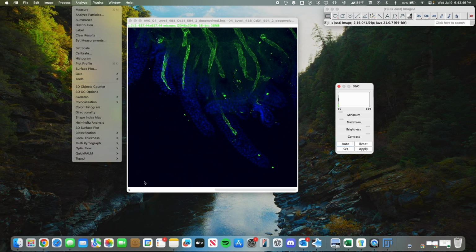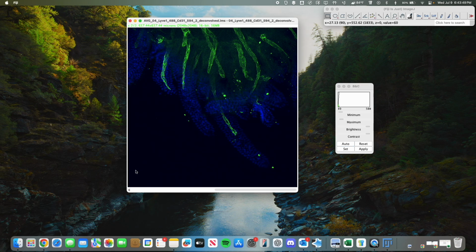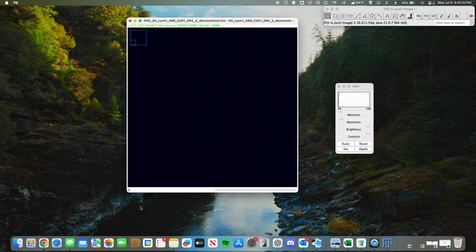But if you were to have that scale, what you would do is you would zoom in to the image, and you can see kind of where we are. And imagine there's a scale kind of built along here. What you could do is take the first tool we're going to use, which is the straight line, and we're going to start where there'd be a bar here, normally where the scale starts, and you would first drop your mouse there and press down. And to keep a straight line, what I recommend doing, see if you move, it can go at an angle. All you can do is just press Shift, and if you move your mouse, it will stay no matter where I go, unless I move it 45 or 90 degrees from the original place, so 0 degrees. And we would just set it to the scale, so whatever the scale is, we would quantify that amount with this line.